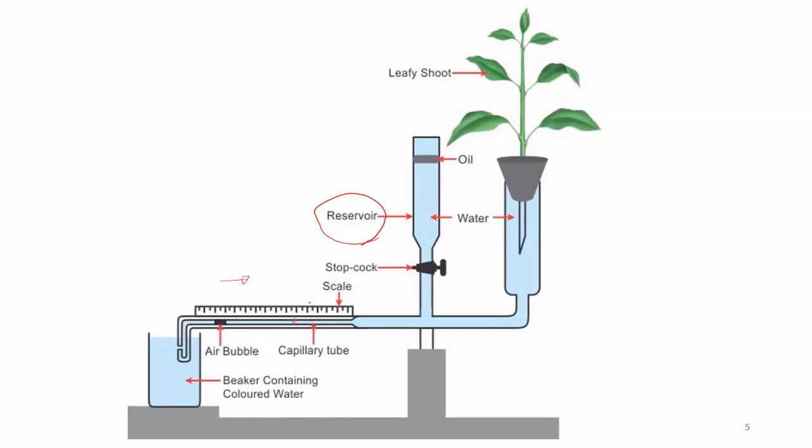So in here now you have the air bubbles in here. Again, this air bubble should go into this area. Therefore, the reservoir can be opened to allow the water movement in this direction. So the air bubbles can move in this direction.